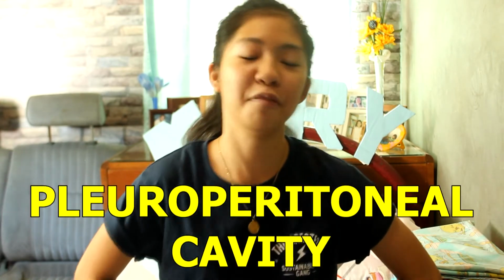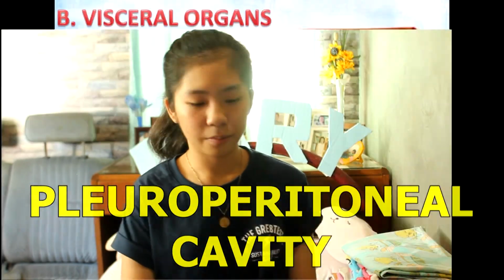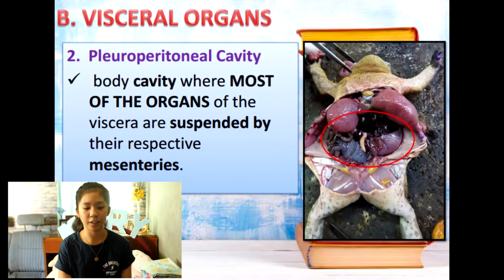Now let's go to the pleuroperitoneal cavity of the frog. It is the body cavity where most of the viscera are suspended by their respective mesenteries.